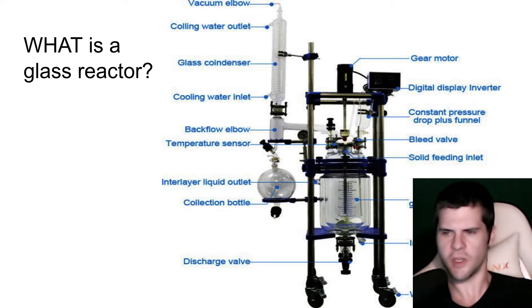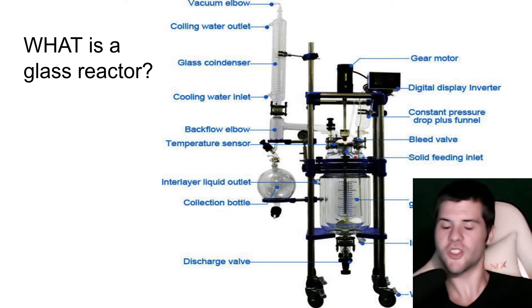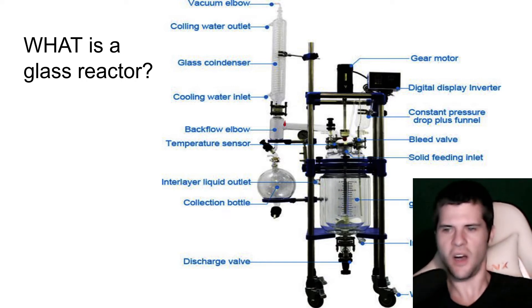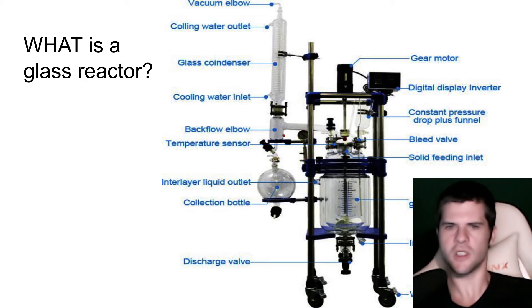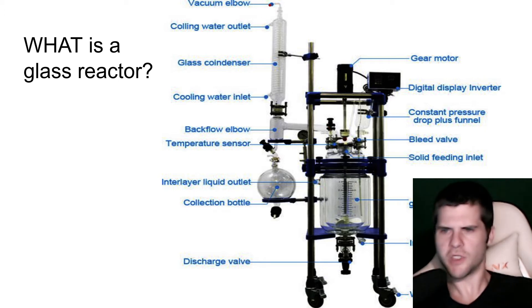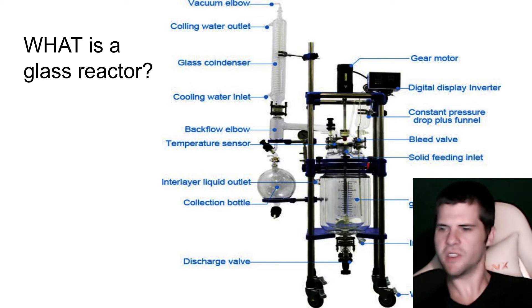That's the temperature sensor — this rod that sticks down in there and measures the internal temperature. A lot of the time you will have something measuring the external temperature; however, you really want to know in organic chemistry what's actually the temperature inside of your mixture. A backflow elbow prevents any of this recondensed material from coming back into the reaction or forces it back, depending on your application. If you wanted to connect the whole thing to vacuum, you would do so at the vacuum elbow, which will be connected to auxiliary equipment. You'll be able to connect this with vacuum hose, and if everything's tight and sealed, this whole mixture will go under vacuum.